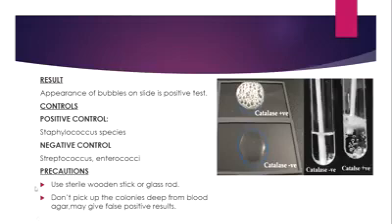The first one is that we have to use a sterile wooden stick or glass rod so that we don't contaminate the test. And then the second one is that we don't pick up the colonies deep from the blood agar, that may give false positive results.